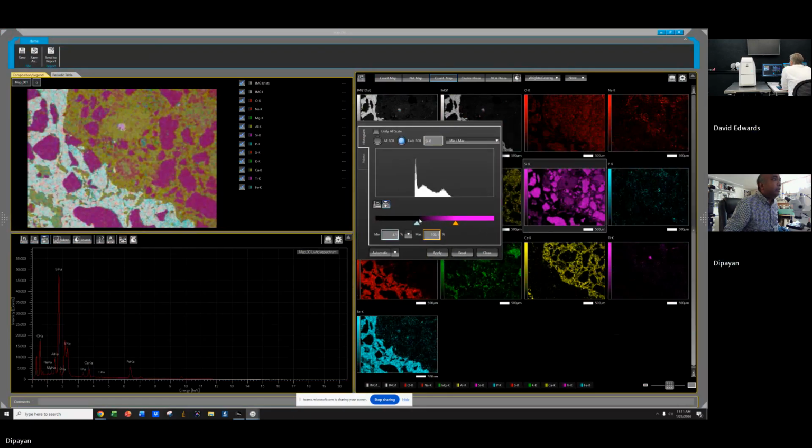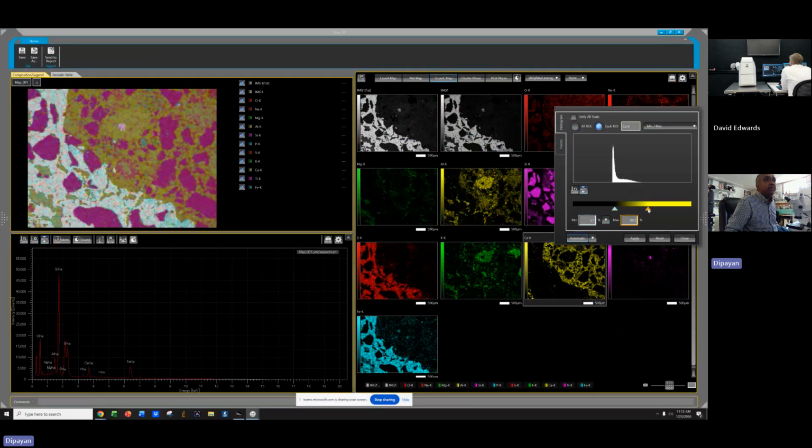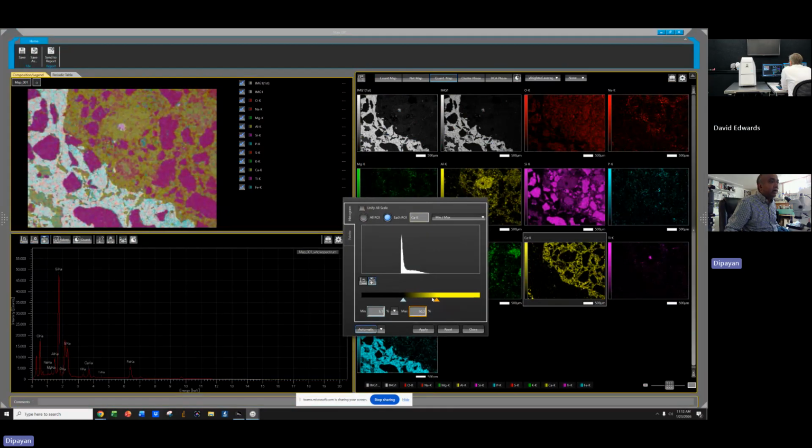So if I go, then some of the phases become dark. Yep. See, I need all my phases to show up, and this one has multiple different phases where silica is distributed, and that's why I'm getting this. But when I go to, say, the paste, in the paste you have to have only one phase. So here, I can literally bring it near the main peak to highlight the paste. Yeah, of course. I don't care about the tail part because I can highlight. So individually, I can highlight this way. Nothing wrong with that, right?